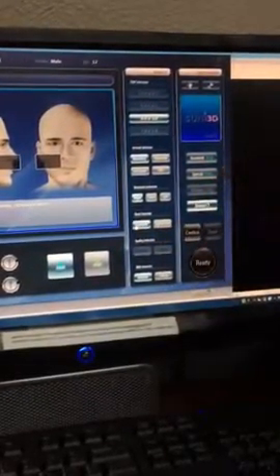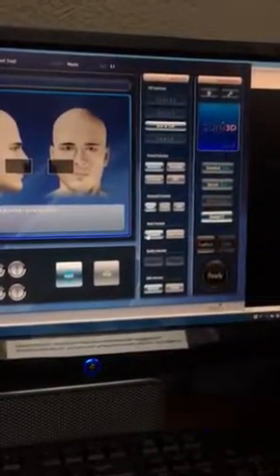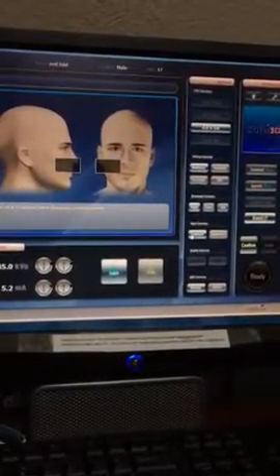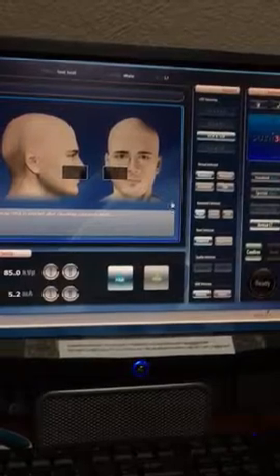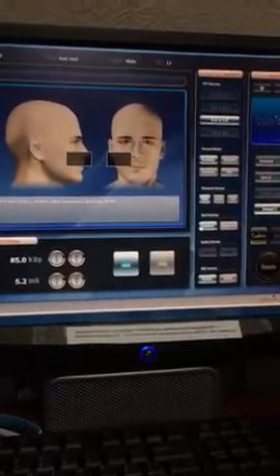There's so much more data in the standard mode that it takes approximately 2.5 minutes to process the image, whereas the application mode has a slightly larger voxel size, not as many files, not as much data to manipulate, and a faster processing time. We're only talking about a few minutes one way or another.